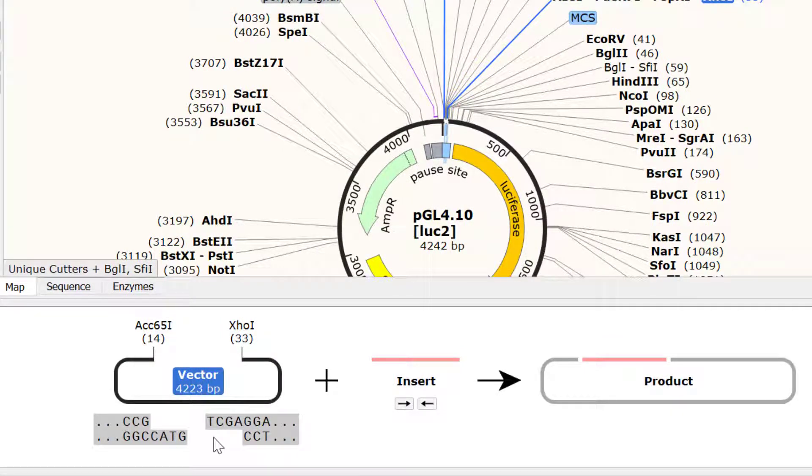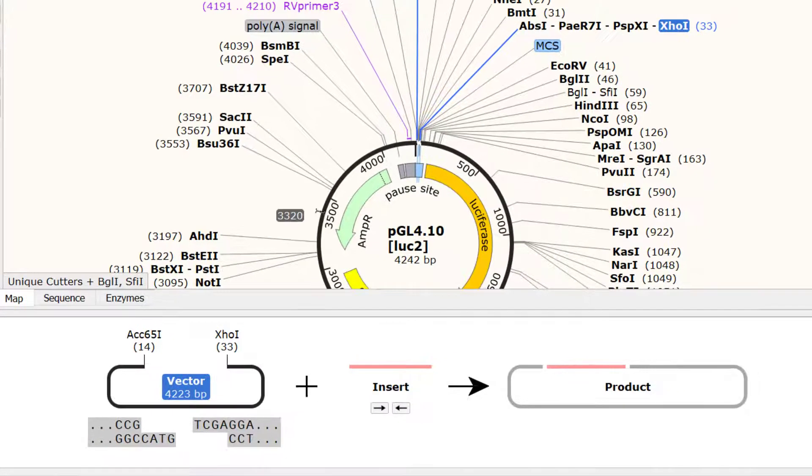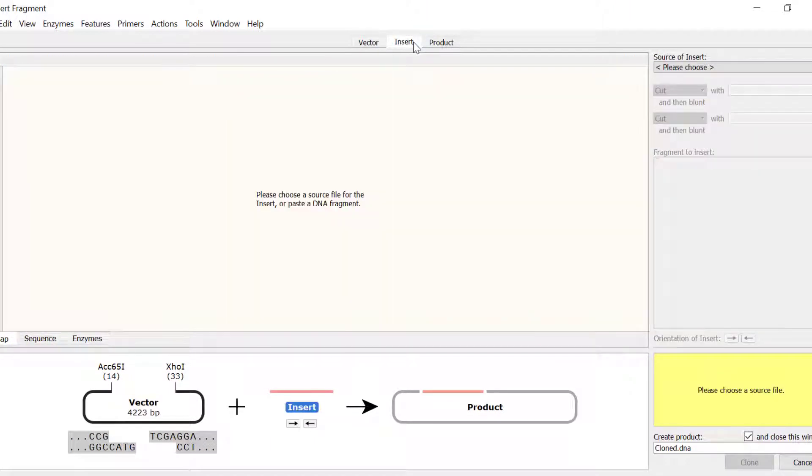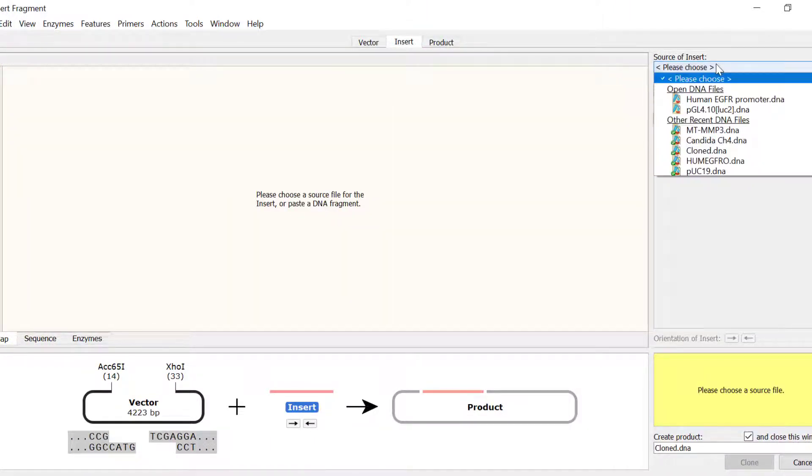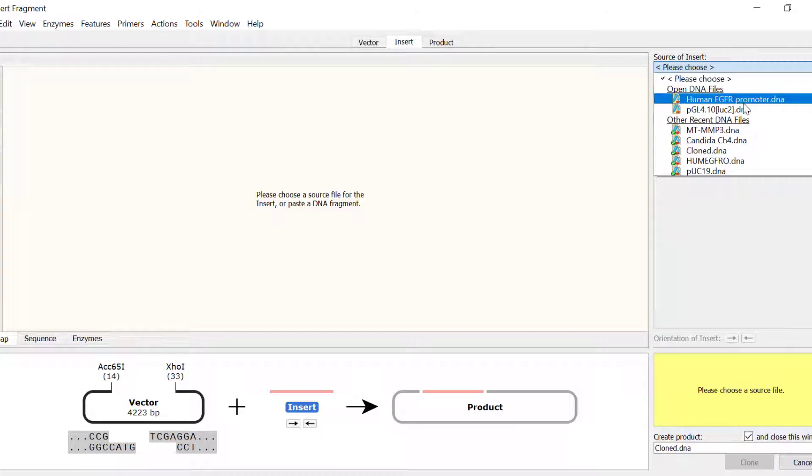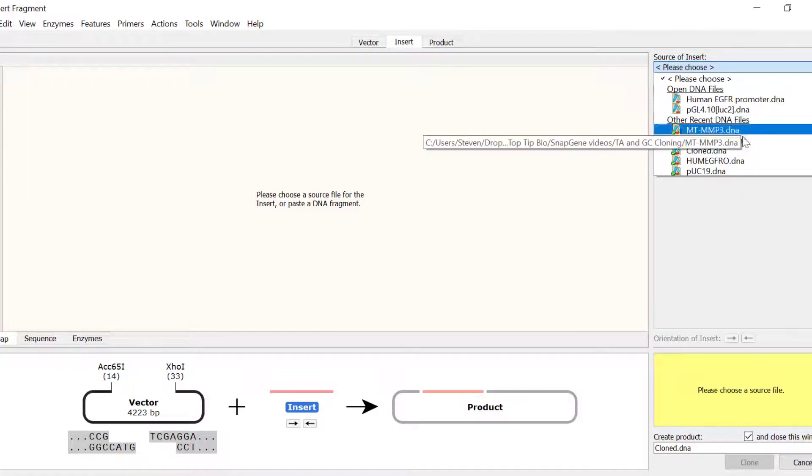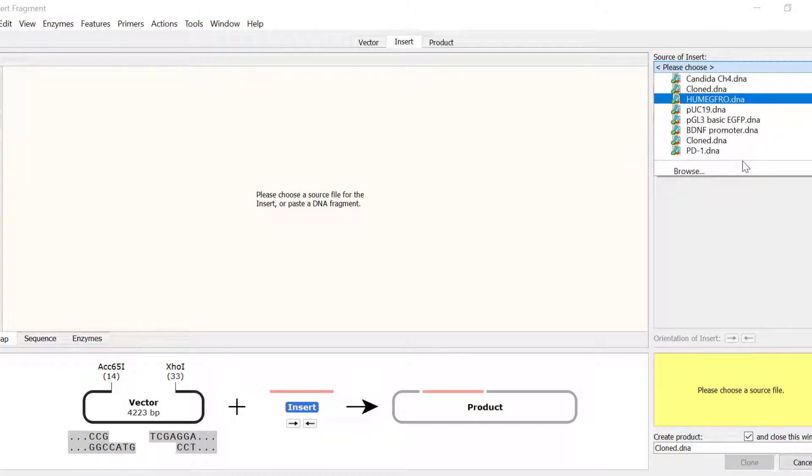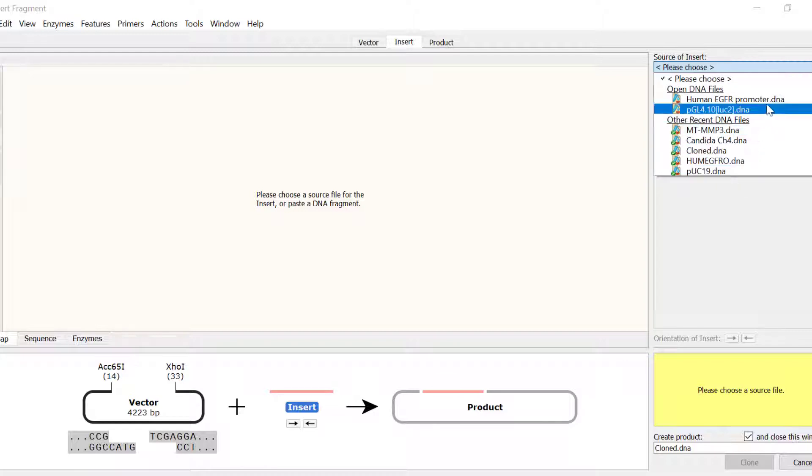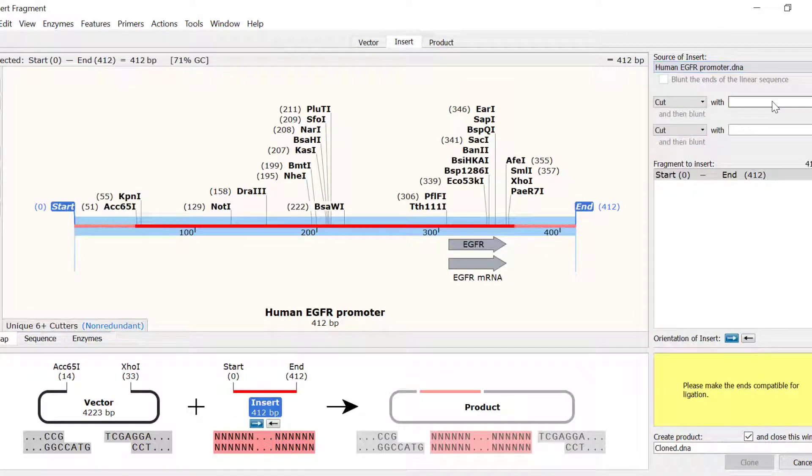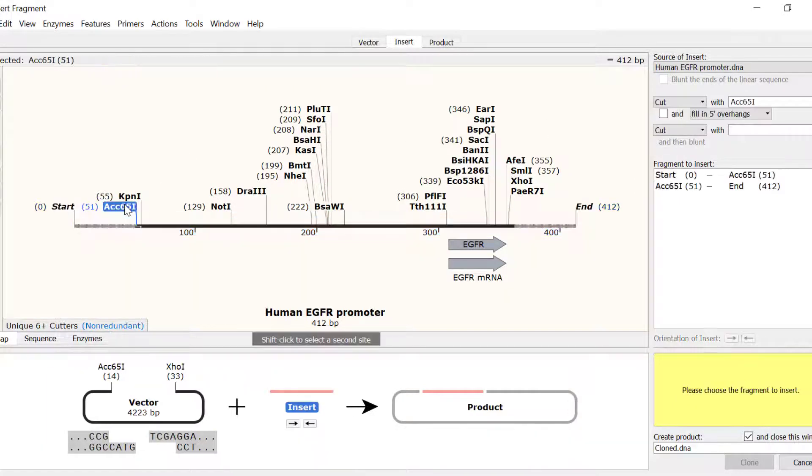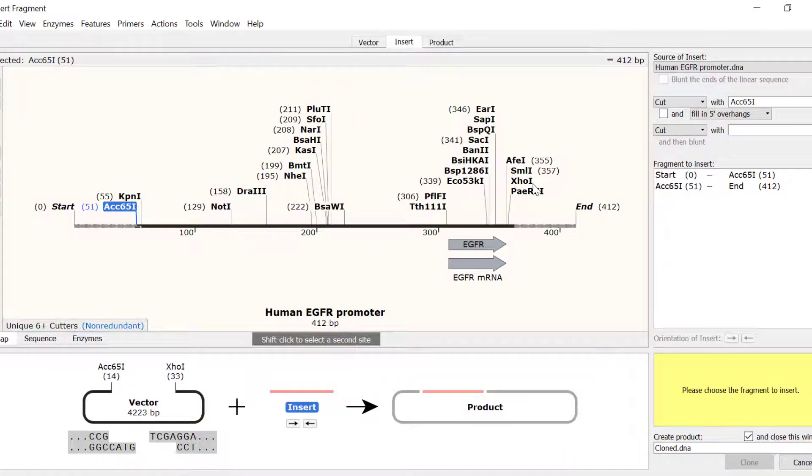Next, we need to select the insert by going to the Insert tab. Select the source of insert by using the drop down menu. Any open DNA files will be listed at the top, followed by recently opened DNA files. You can also browse your computer to select a file not listed here. For this example, I want to use the Human EGFR Promoter file that is open, so I will select this. Then, I will select the ACC651 and XHO1 sites by shift clicking on them as before.